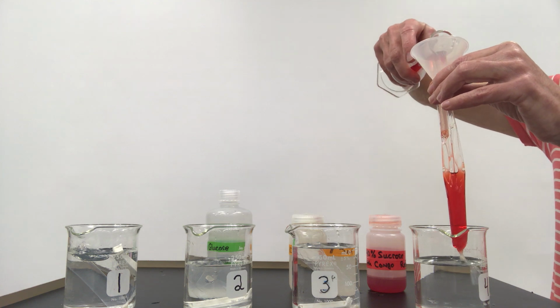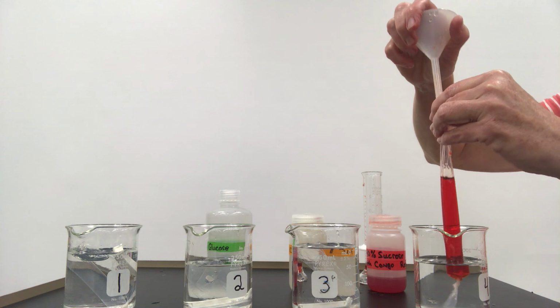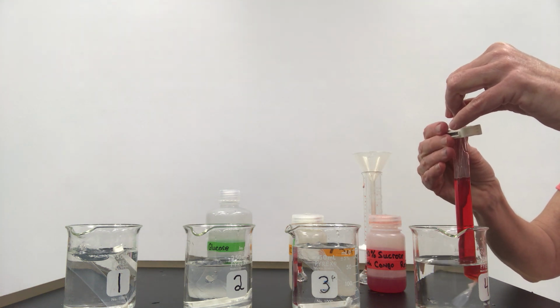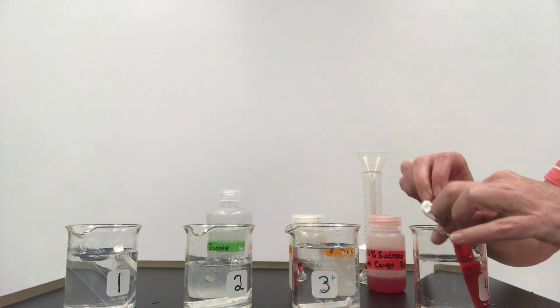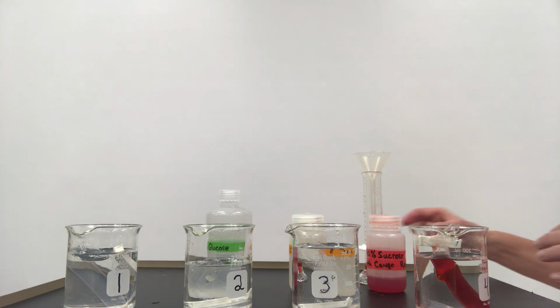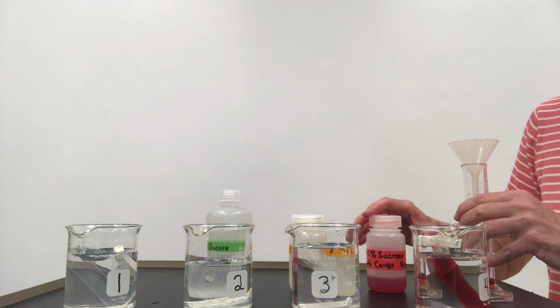So we're going to fill this sac up with 20 mLs of the fluid that we have already measured out. We're going to clamp it. We would then get a weight on the scale, and then we would submerge it into the fluid and we will leave it alone. Now this will run for about an hour, hour and a half.